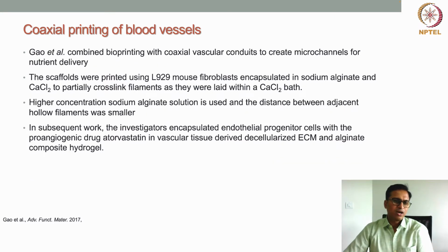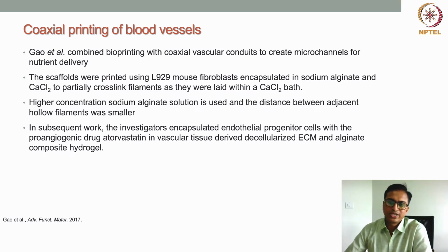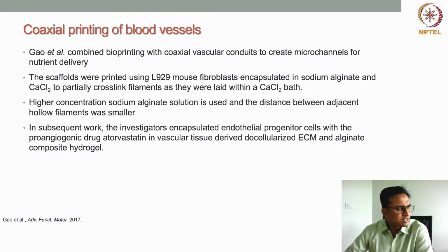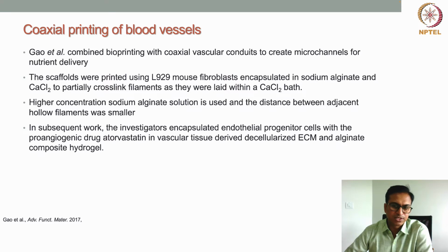Gao et al. combined this bioprinting of coaxial vascular conduits to create microchannels for nutrient delivery. What have they done? They used concentric nozzle extrusion with sodium alginate as the bioink, loaded with mouse L929 fibroblast cell lines, and they filled the inner core of that concentric nozzle, connected to the CaCl2 solution feeder.